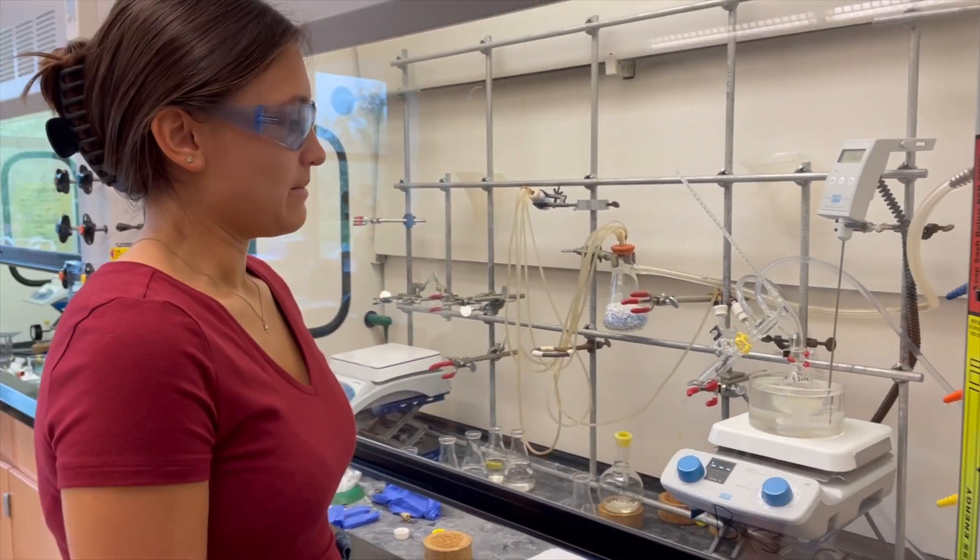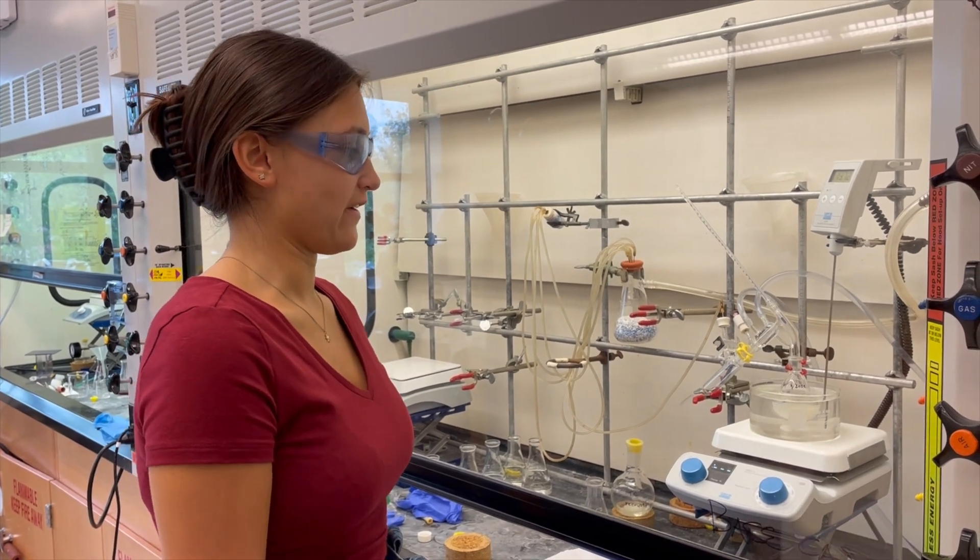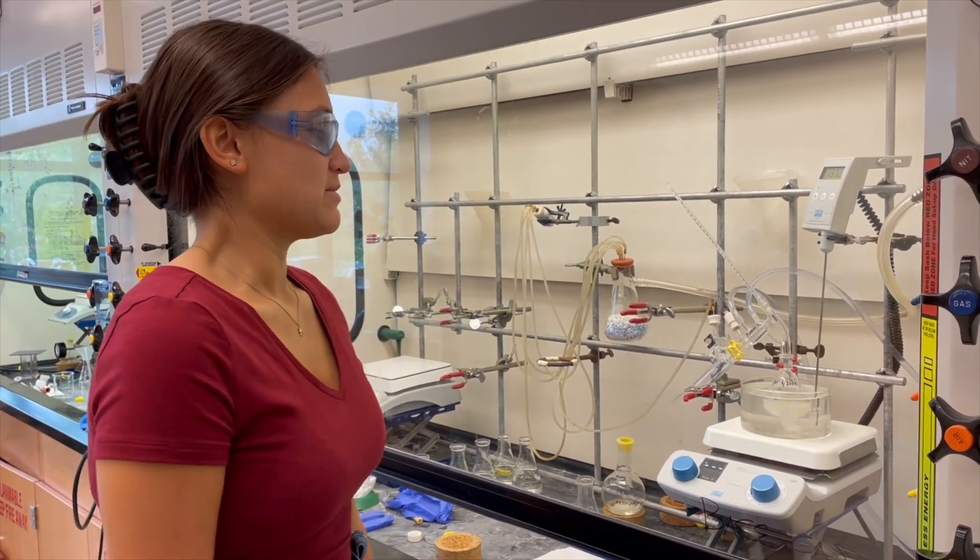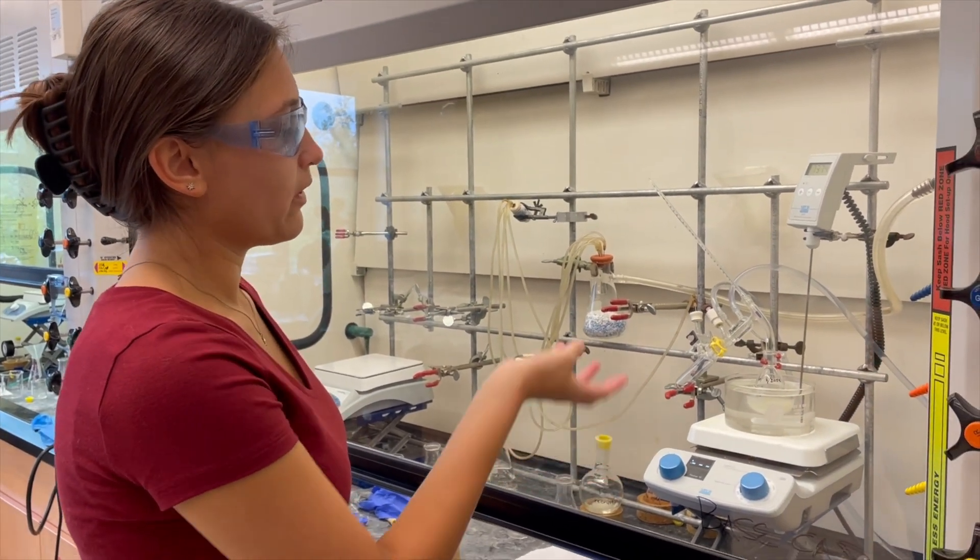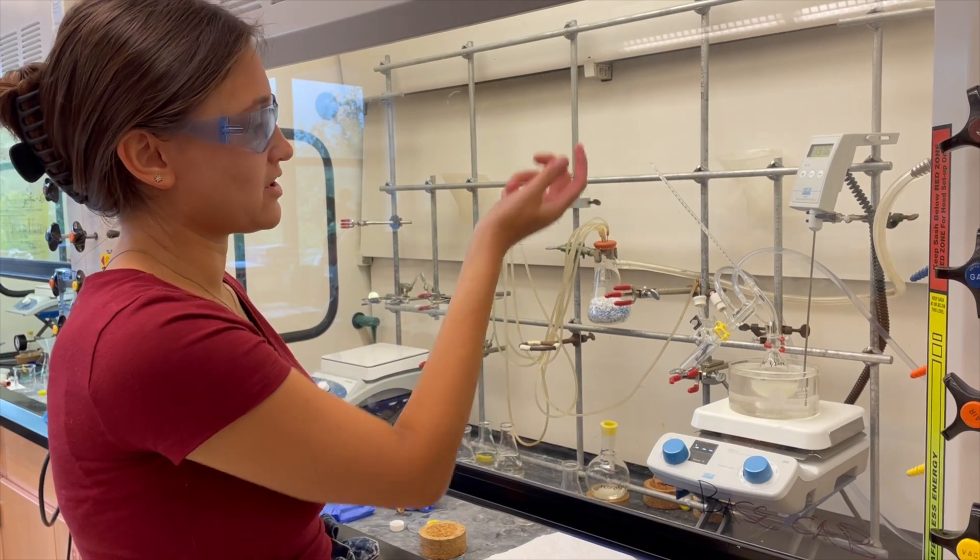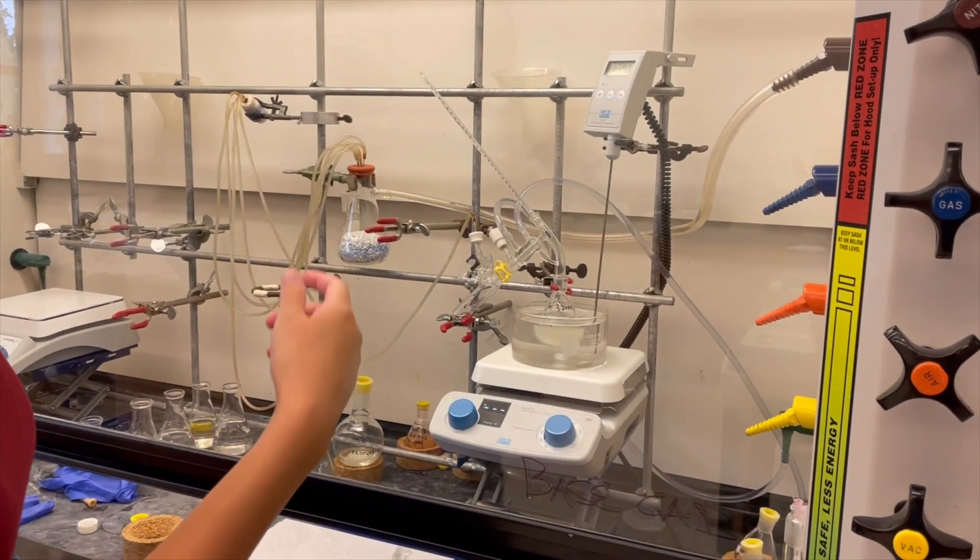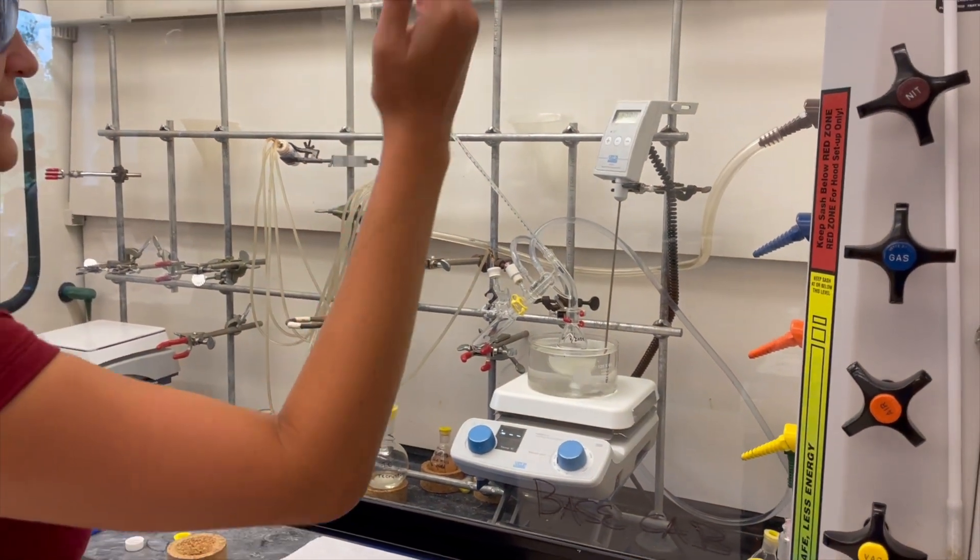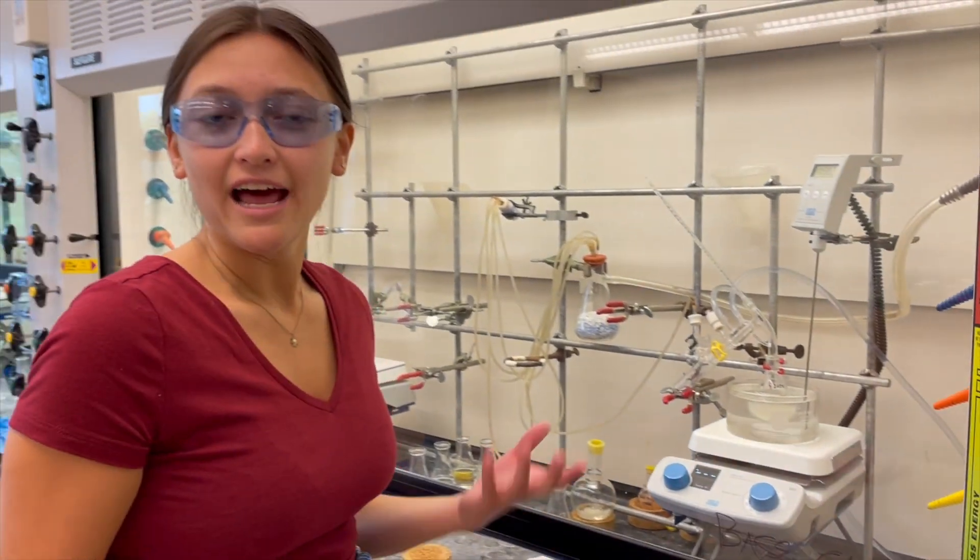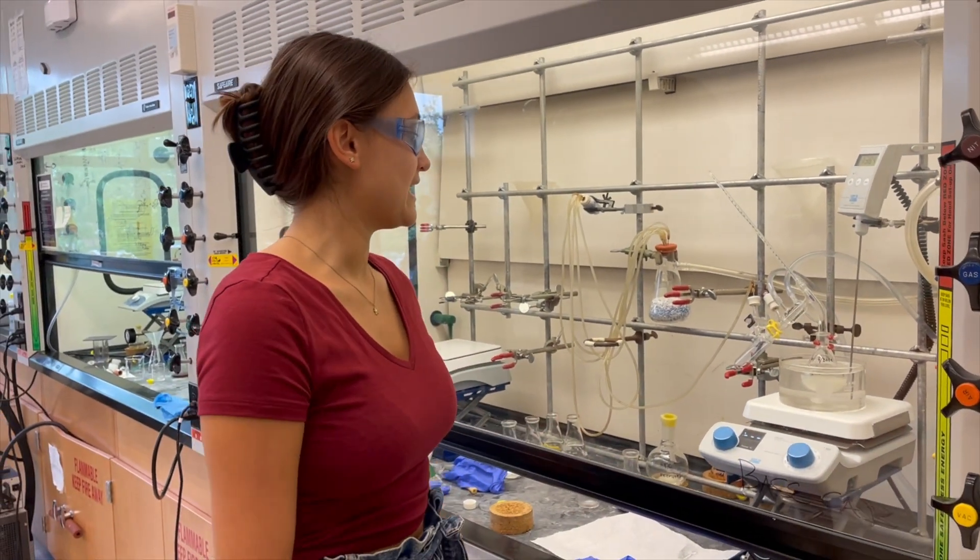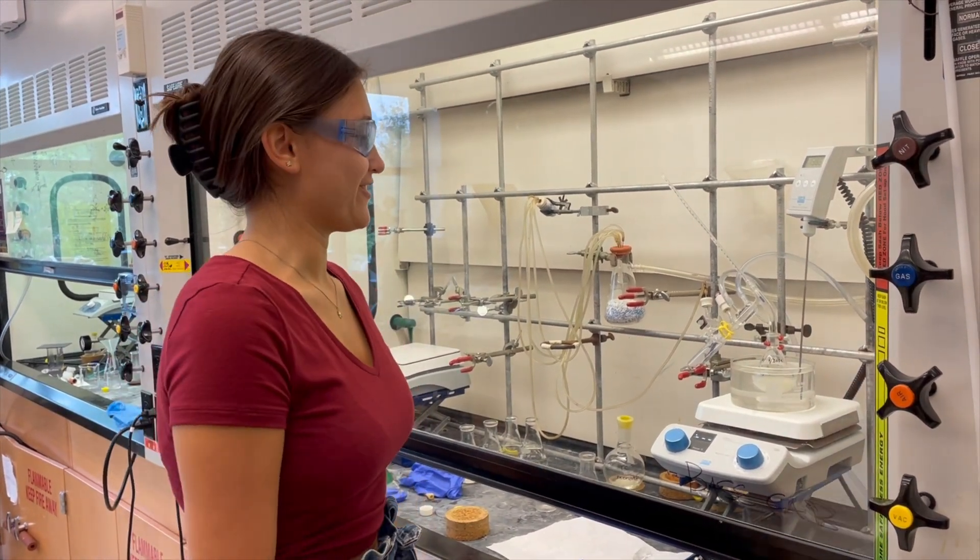So basically right now I'm heating up the Hunig's base to about 150 degrees Celsius, which is about 300 degrees Fahrenheit, so it's pretty hot. That's above the boiling point of Hunig's base so it's basically going to start to boil and as the gases kind of lift up they're going to start to condense around this area where water is flowing around it. So the gases are going to condense and as they condense they're going to fall down this kind of chute here and they're going to collect in the collection flask and everything that collects is going to be clean. So this is a really important lab technique that all of us learn that we can make stuff that we use every single day.